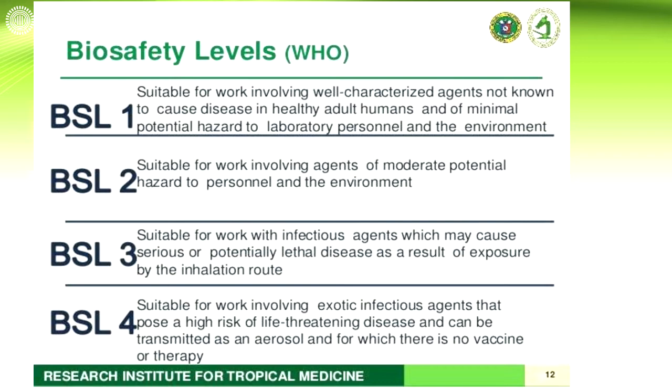For the biosafety level 4 naman, so these are the microorganism under the risk group 4. The work involves exotic infectious agent that can pose a high risk or life-threatening diseases. Kasi nga naman, walang treatment available for that. Di ba nga sabi ko kanina, kapag risk group 4, walang gamot. Walang vaccine, walang gamot. Kaya nga naman, dapat biosafety level 4 din ang gagawin mo.